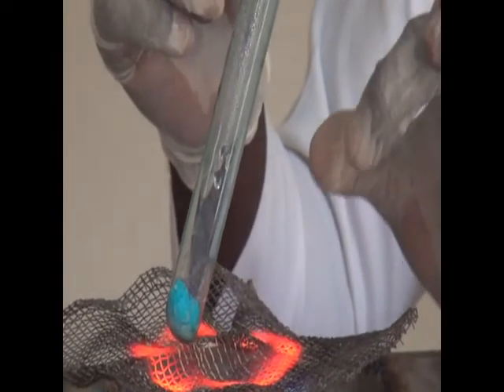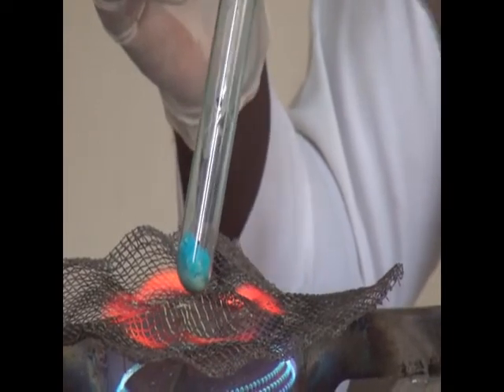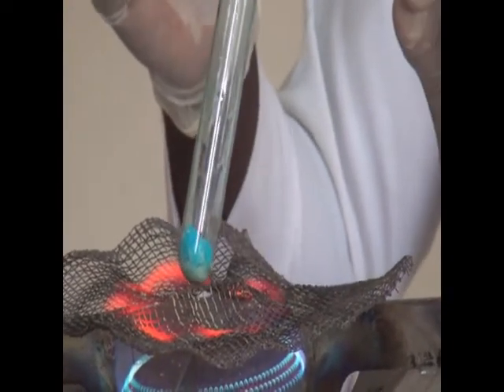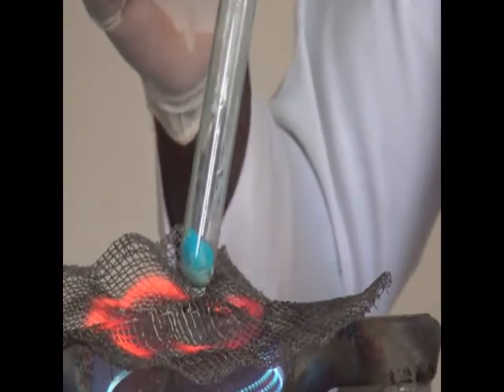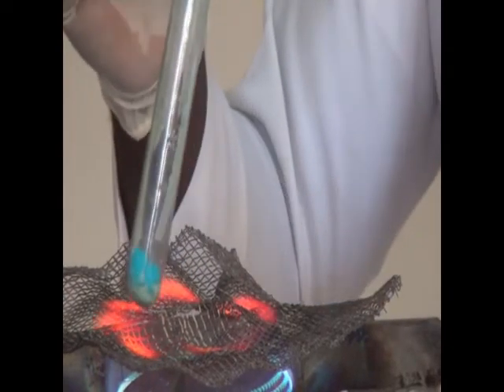As the cupric sulfate is being heated, the color will change from blue to a gray or white color, indicating that sulfur 4-oxide gas is being heated up and given off as a gas. Now look at what is happening. A gas is coming off.